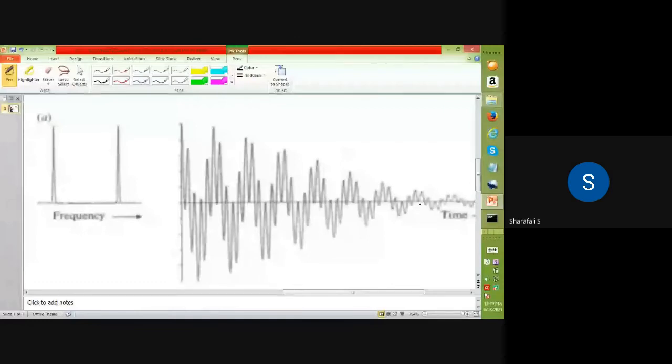Along with that, we have some kind of cosine spectrum radiation. If we consider that intensity, we have to consider the total. So from here it will go like this and come back, and you can see that pattern also here. Along with that, we have the interference with mu 1 and mu 2 if you are having two frequencies.